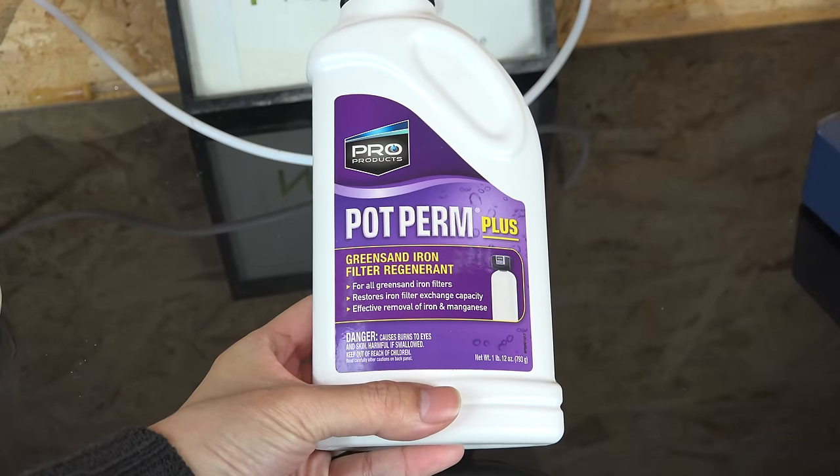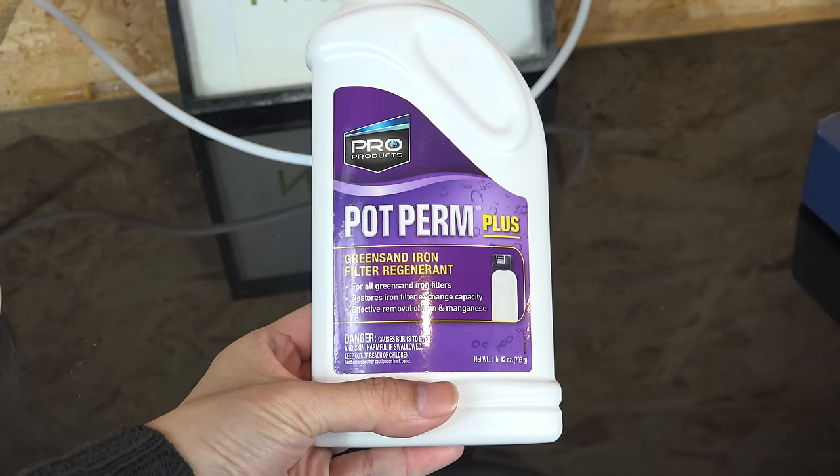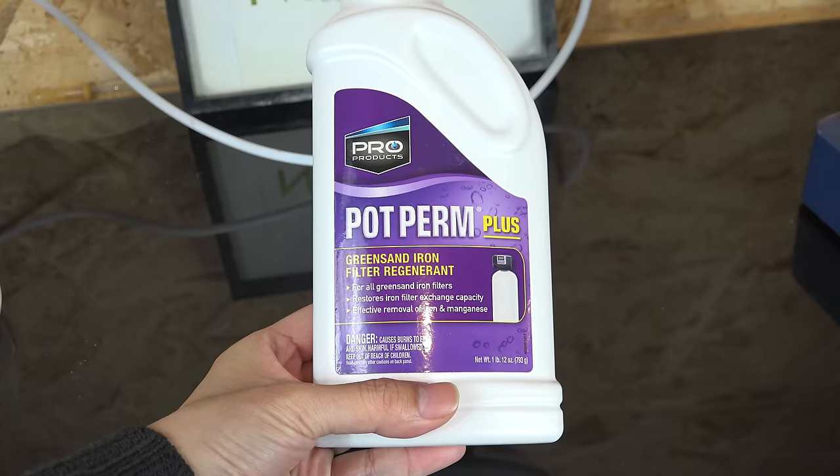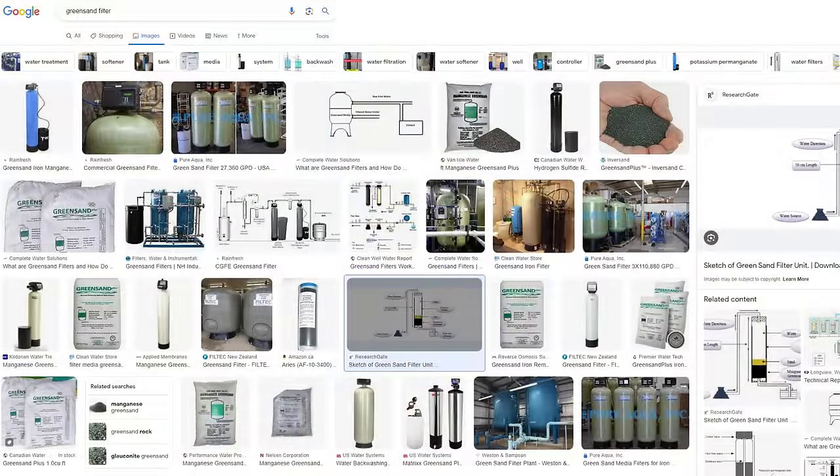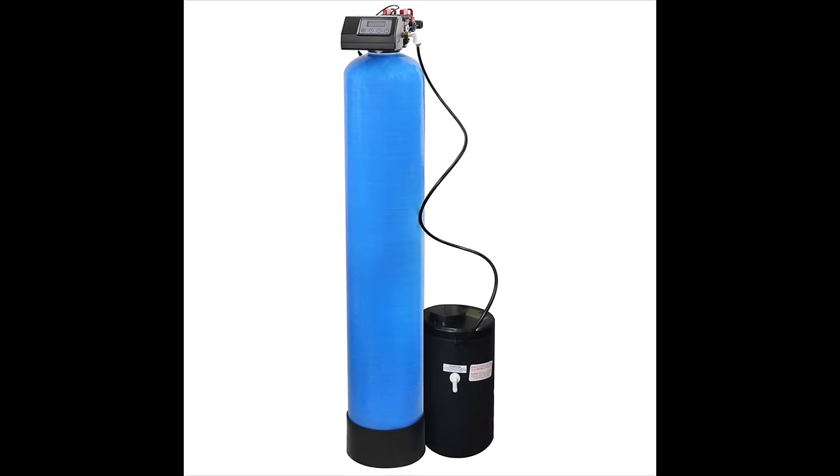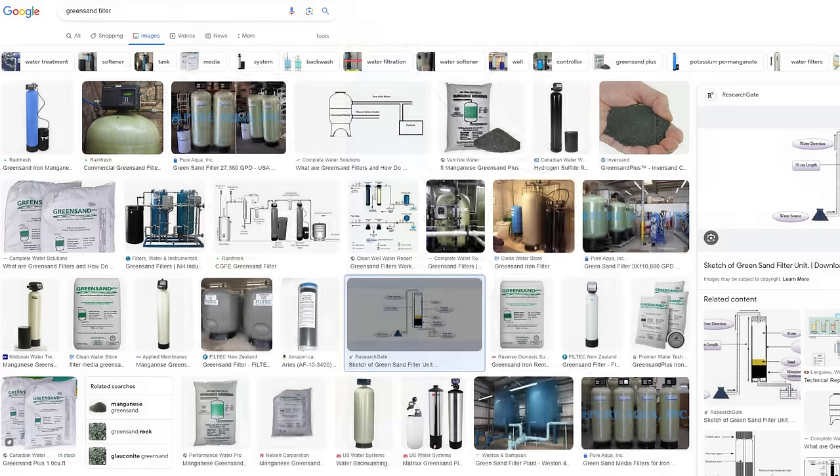Now for our titrant potassium permanganate. My source is this commercial green sand filter regenerant. For those who don't know, green sand filters are used by individual households to remove redox active contaminants in water like iron, manganese and hydrogen sulfide.